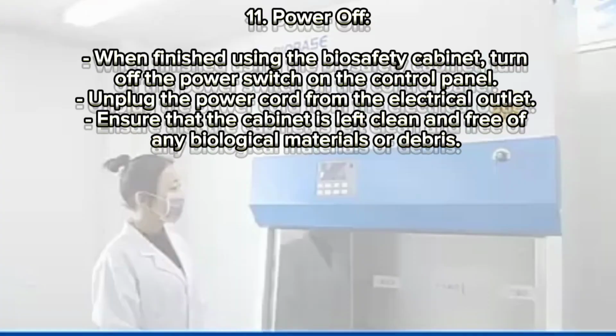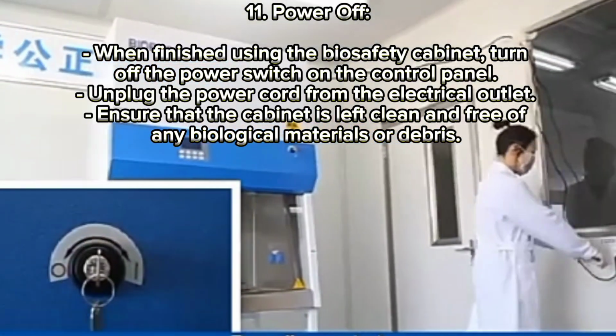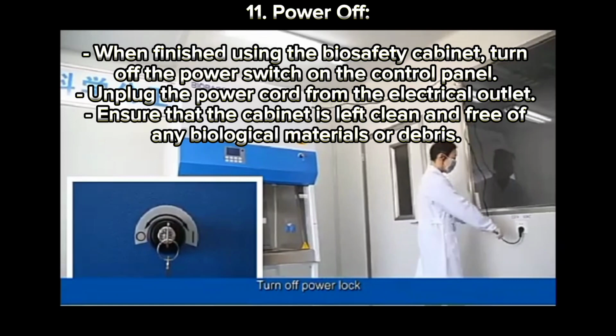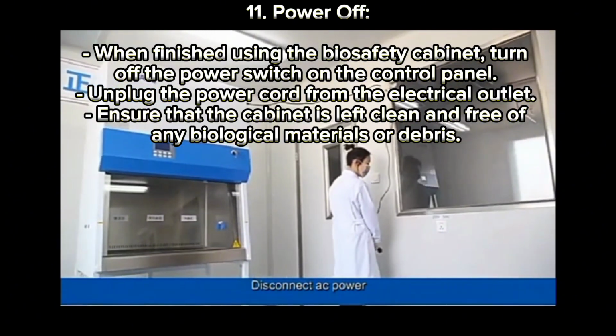Lastly, power off. When finished using the biosafety cabinet, turn off the power switch on the control panel. Unplug the power cord from the electrical outlet. Ensure that the cabinet is left clean and free of any biological materials or debris.